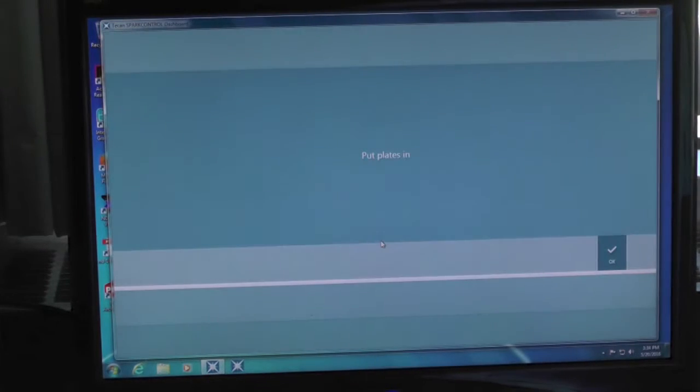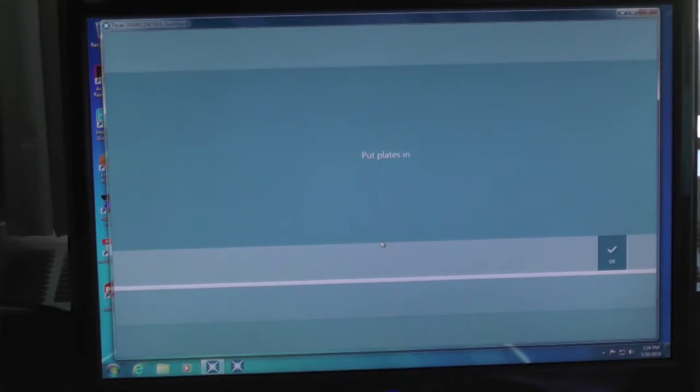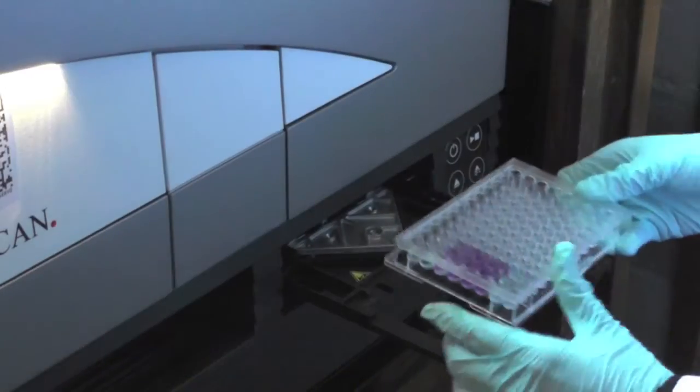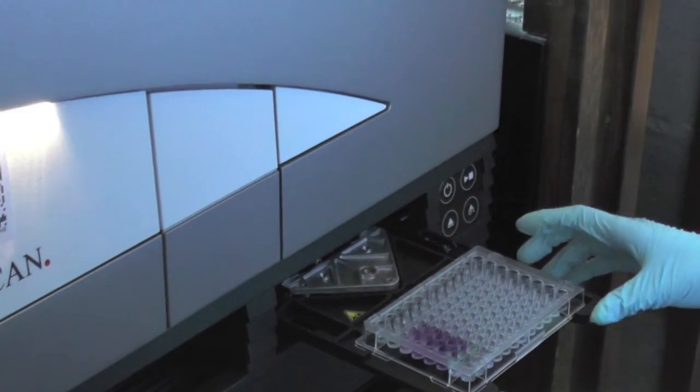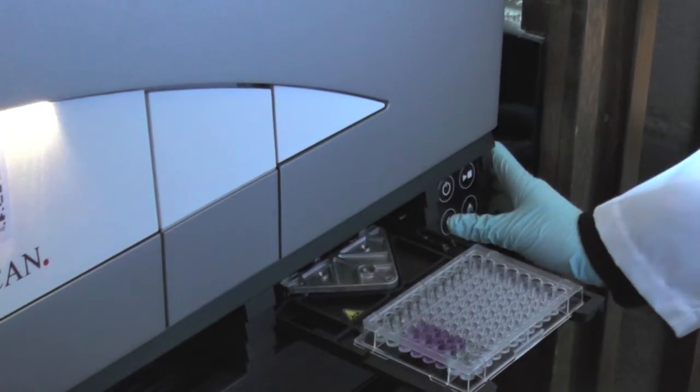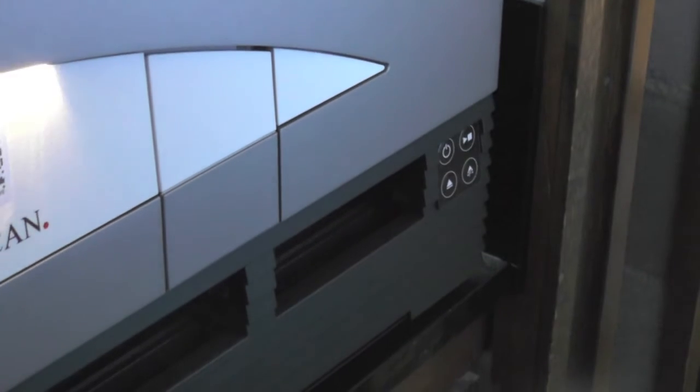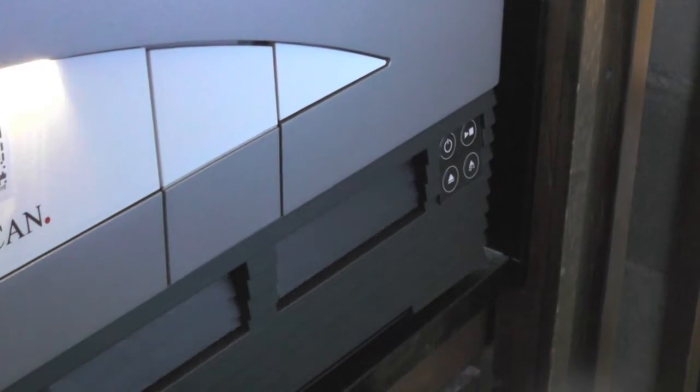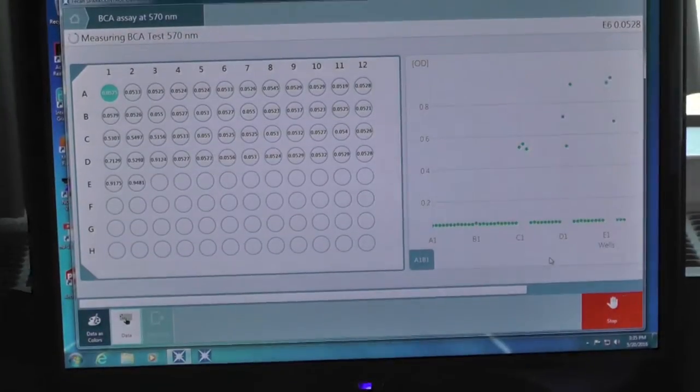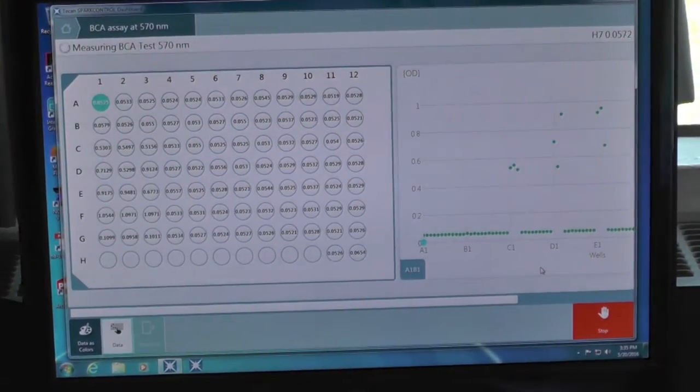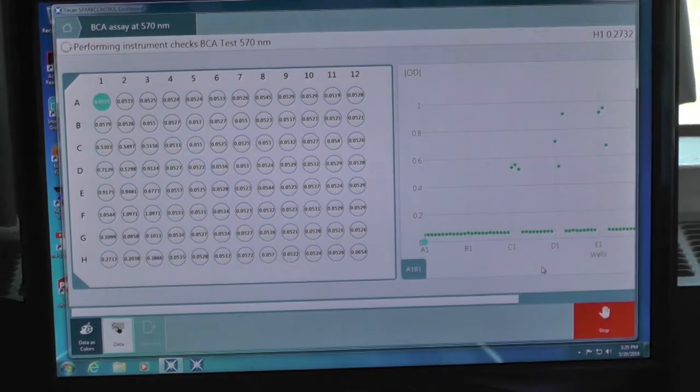The program will instruct you to put your plate in. Please make sure your A1 is located at the top left corner. Once complete, click OK. The plate will be read at the designated wavelength.